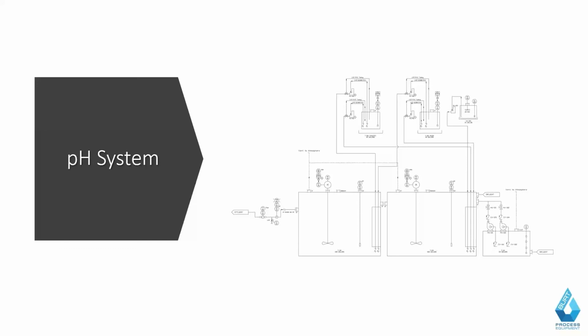Obviously, there are a lot of different nuances that can come into play: access, different chemistries, different loop designs. But you still follow a lot of the same steps overall in these types of systems, where you develop your flow profiles, your water generation rates, your water quality requirements, your waste profile, your waste generation rates. And this is really what goes on when we're doing this kind of design, behind the scenes for specification and then for building your actual building.